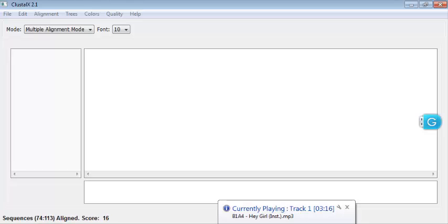The steps are totally the same as for the BPMP files before. It's taking too long, I'm so sorry for that. Okay, now it's going to the end. You just have to wait for the sequences to appear on the screen.